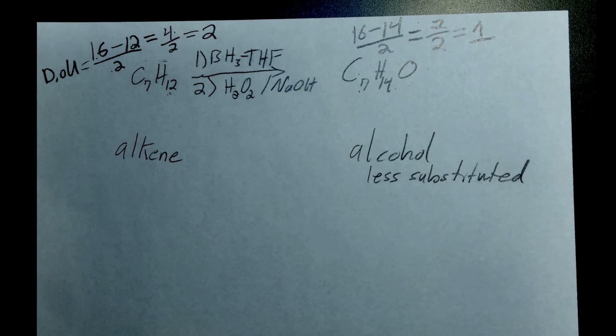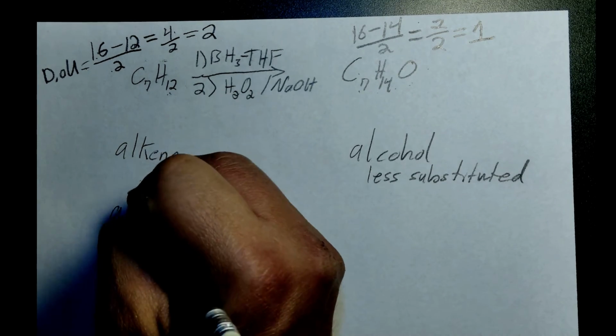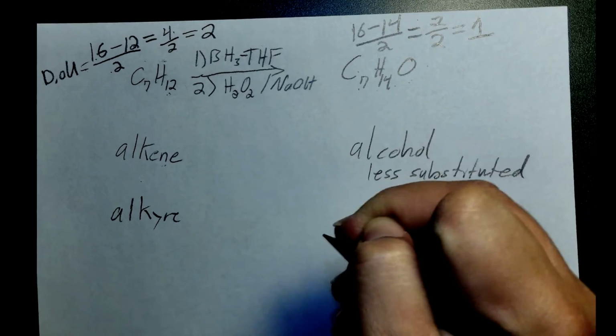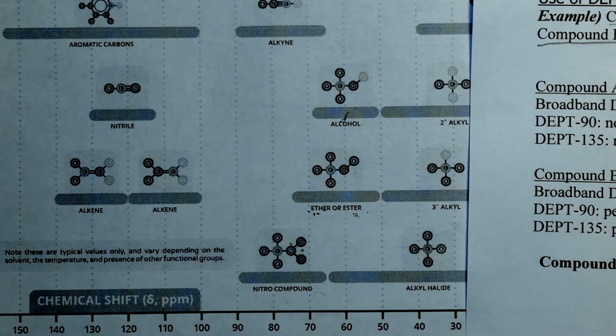So how do we take this? Well, what we should realize is in Chapter 9, we learned that there is a way to react borane with triple bonds and make enols that turn into aldehydes. We'll just have to keep that in mind. That's likely not what's going on here, but I don't know, maybe, because it could be an alkyne, so let's just take a look at the structure. Could it be an alkyne transforming into an aldehyde? Let's rule that out right away.